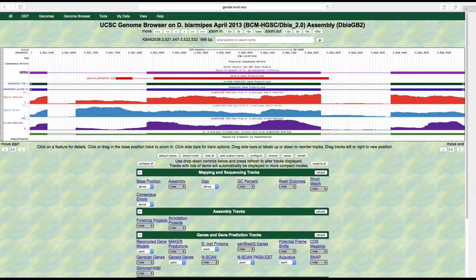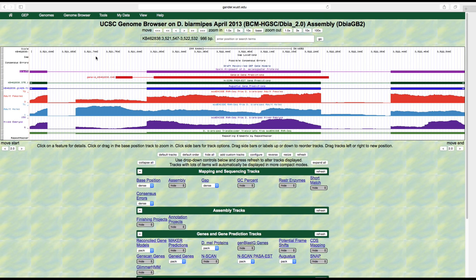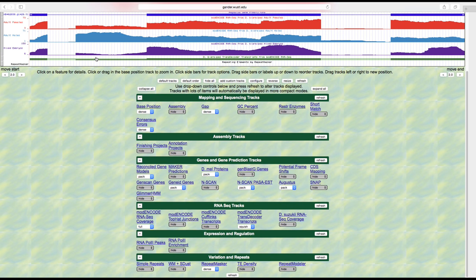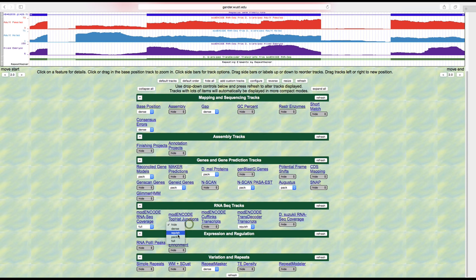We are now navigating to the genomic region that contains the presumed tra ortholog in the Drosophila biarmipes whole genome assembly and will examine the evidence tracks for the presumed ortholog. Scroll down to the RNA-seq tracks section and then change the display mode for the modENCODE TopHat junctions track to pack to view the individual splice junctions.